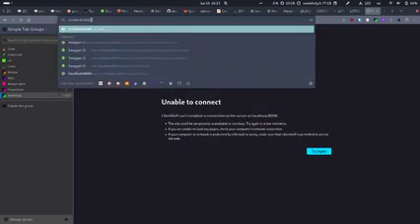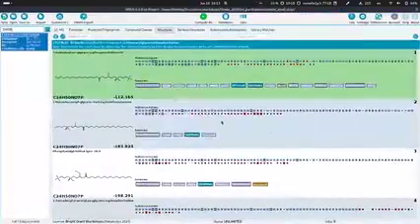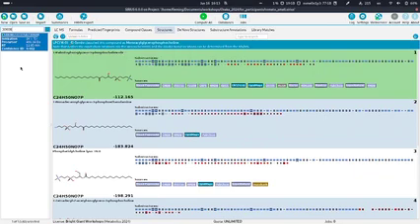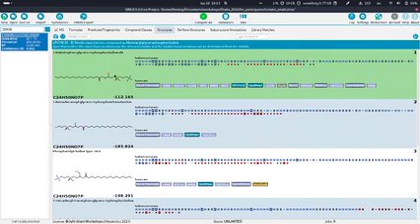Okay, just because we're running out of time, I just want to prepare something very quick. But before, just one thing I want to show. We talked a little bit about this lipid class prediction. And this is how it looks when we have actually predicted a lipid here. You can see here, El Gordo, which is the name of the method, has predicted this feature to be a lipid. And it has predicted it with this particular lipid class. And here we can also see that this lipid class matches our top structure. So the structures we find do not necessarily have to correspond to what El Gordo predicts, but here it is the case.